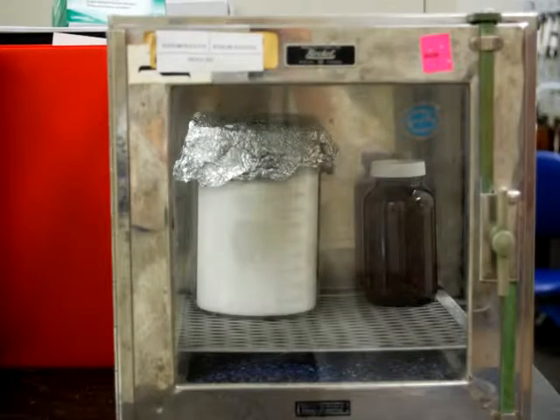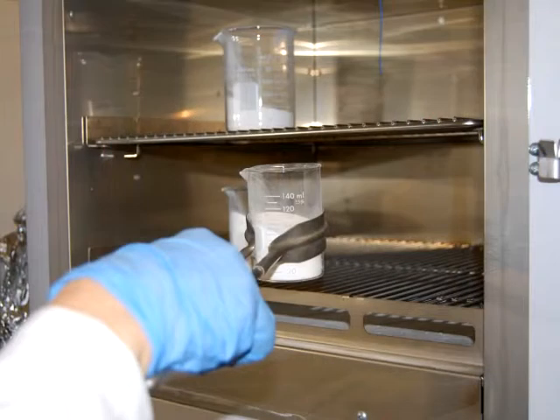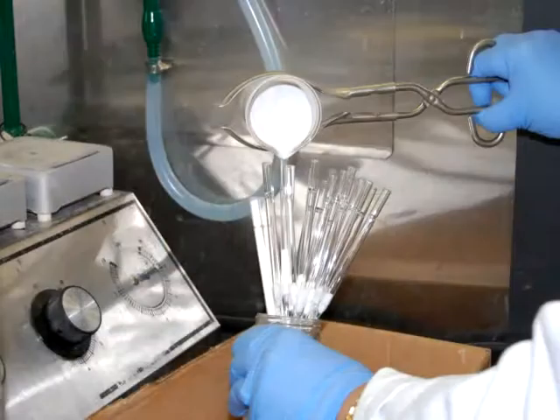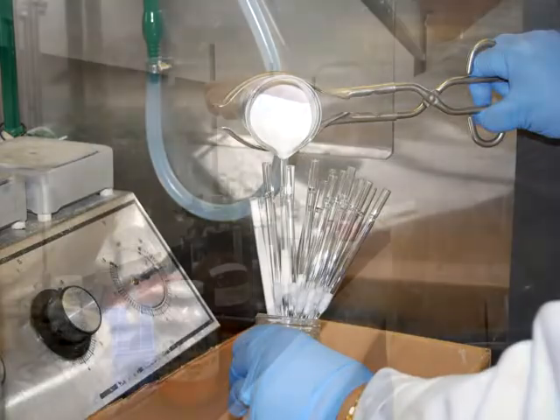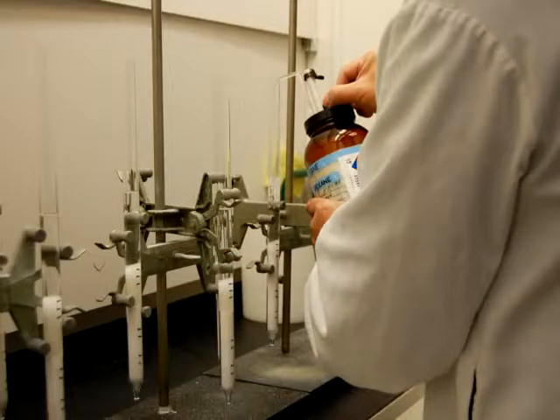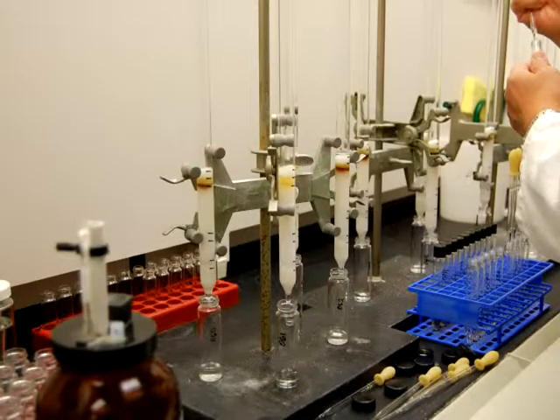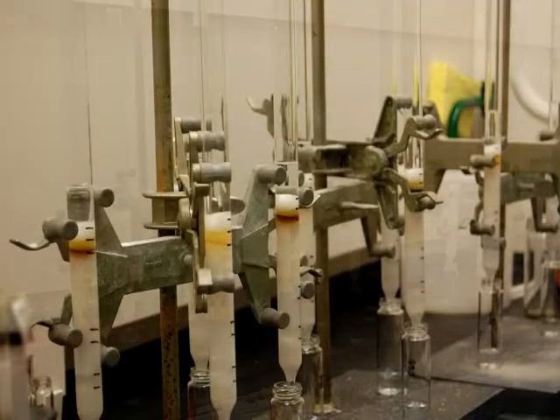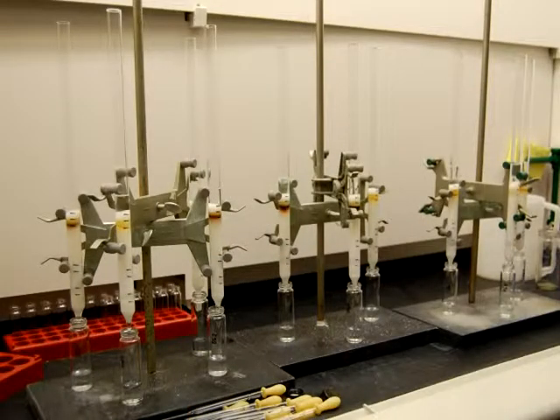The sample cleanup process is a manual process that can take up to three days to complete. The manual sample cleanup consists of a series of many steps, including the baking of absorbents, the preparation of acidic and basic silica, as well as other required absorbents, packing and conditioning of the columns, then loading, eluting, and fraction collection of the compounds. The glassware is then cleaned, and the process starts again.